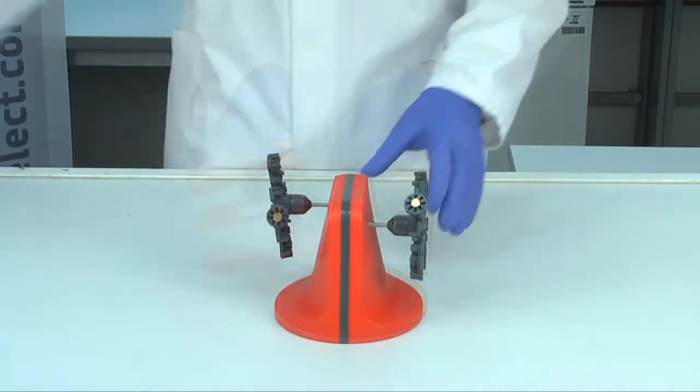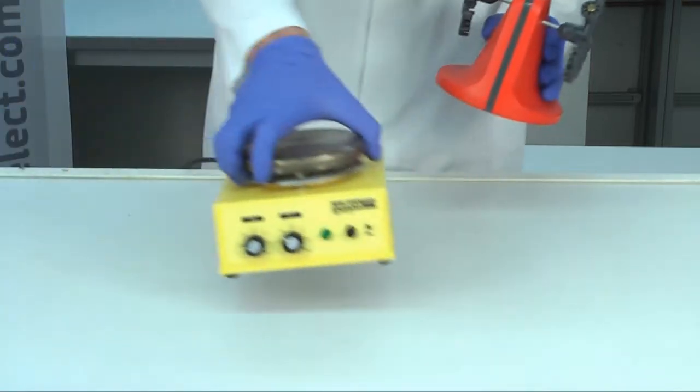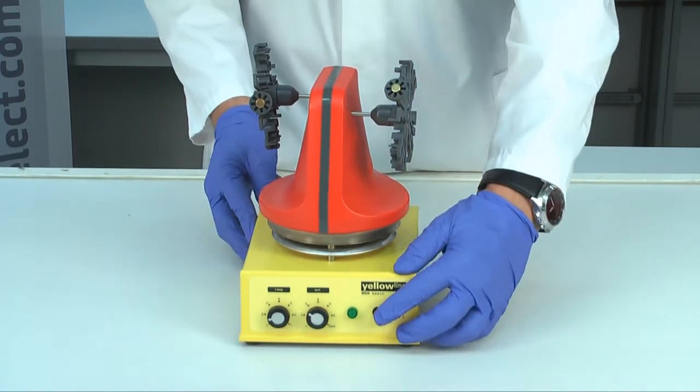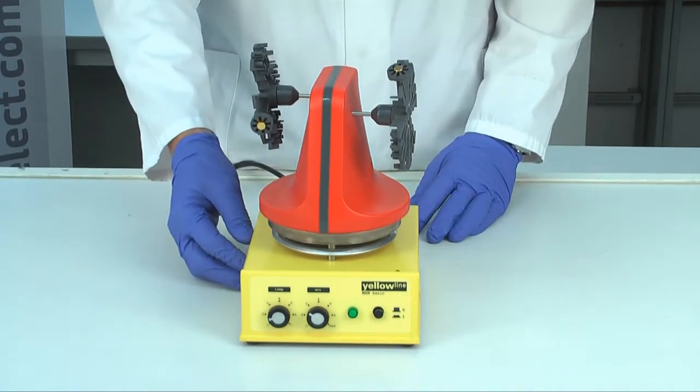For mixing, just place it on a magnetic stirrer. Adjust the mixing speed with a magnetic stirrer.